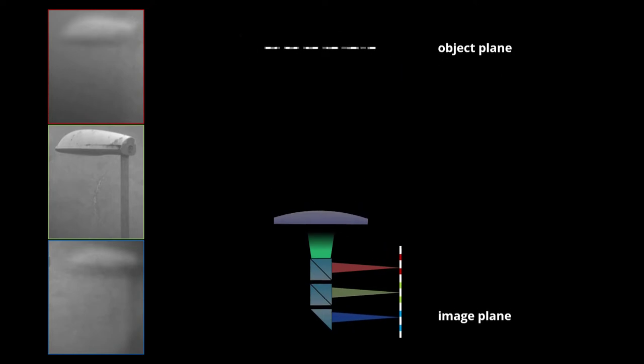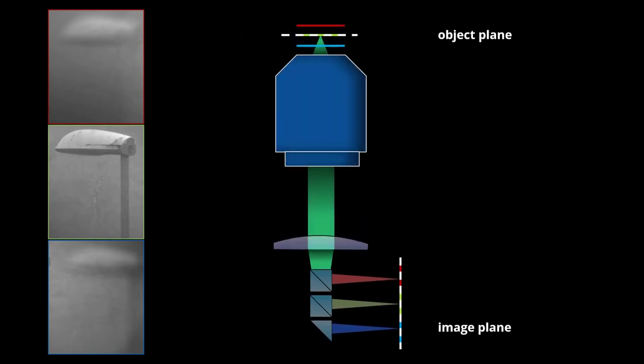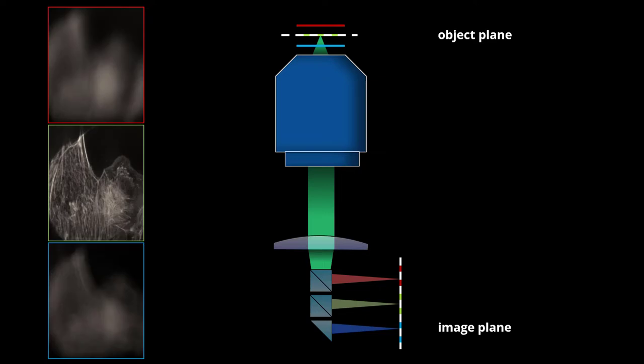We can do the same thing also in a microscopy setting, and that has a very important implication. The reason is, you can see that the cell that I took a picture of here, that is visible in the other two planes, but it shouldn't. And ideally, we want to get rid of this.